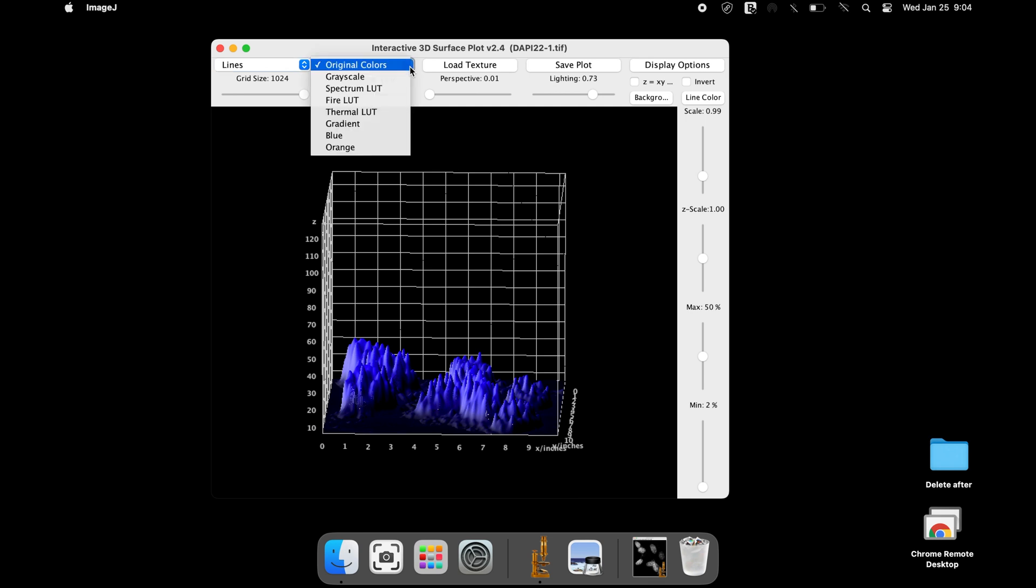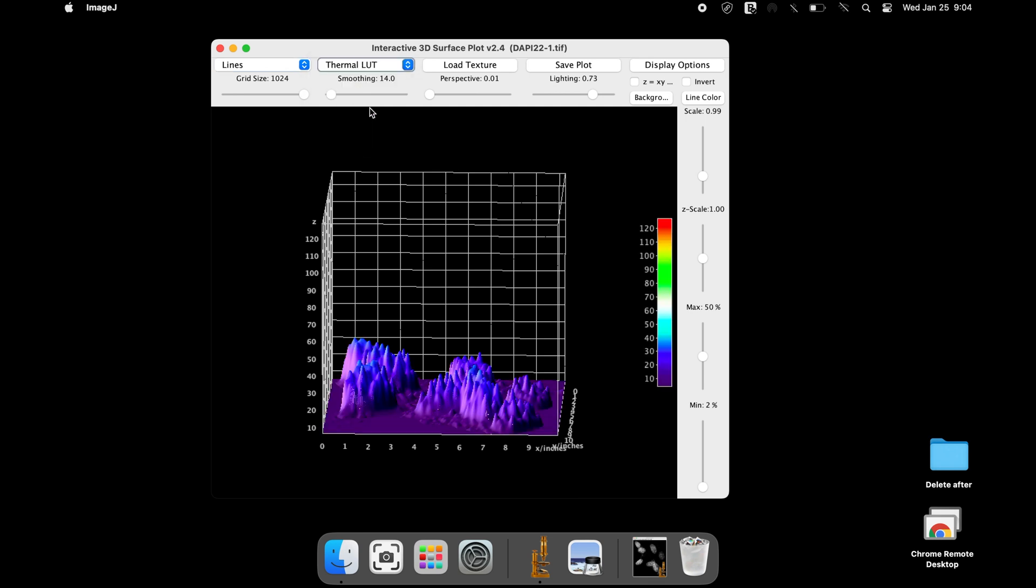In addition, it is possible to add the calibration bar to the 3D surface plot image.